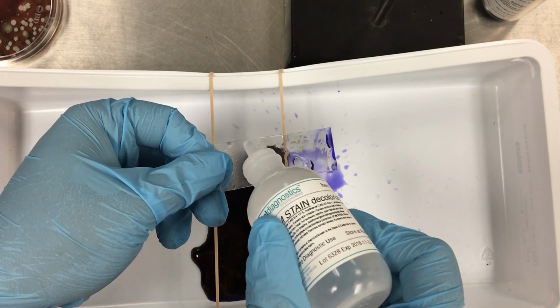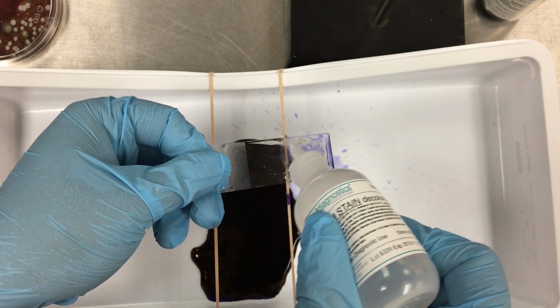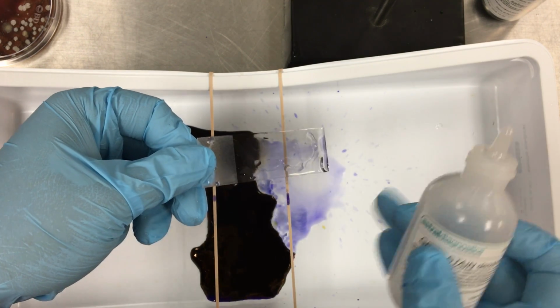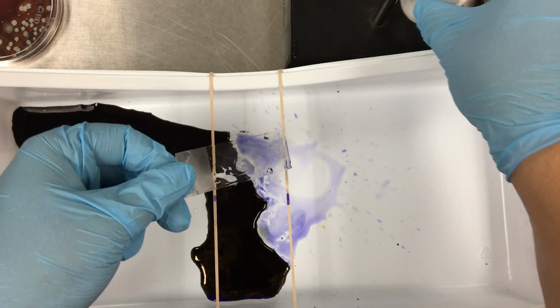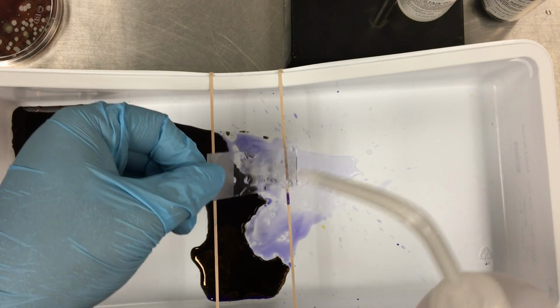So right now it still has quite a bit of color to it. So I'm going to keep dripping. And now we can see the runoff coming off of the slide is now clear, so it's done decolorizing. And then we want to be sure to rinse the decolorizer off when we're done with some distilled water.